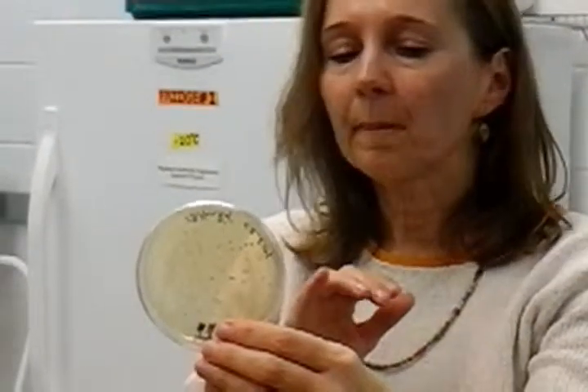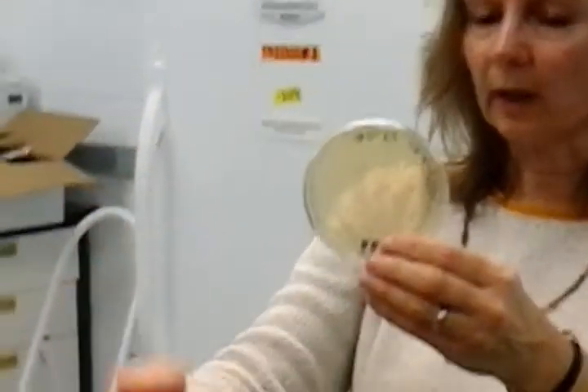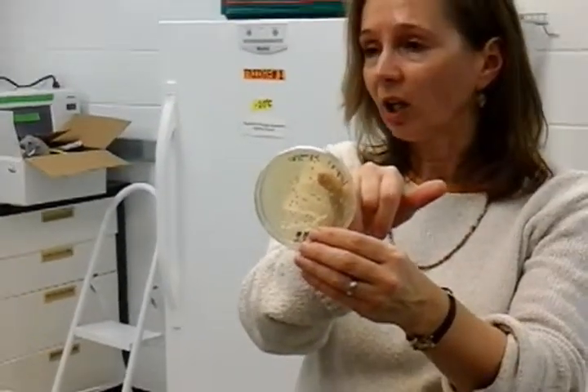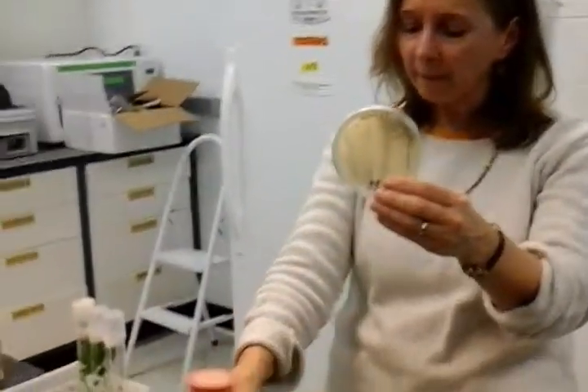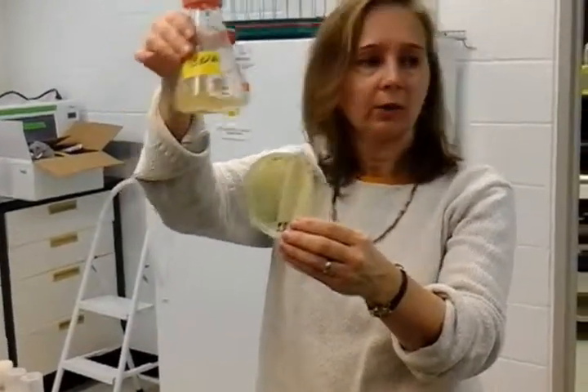If we didn't, we'd have a lawn of agrobacterium growing. When we do the overnight cultures, we actually do PCR on the colony — we'll just take the colony, put it into a solution, do PCR, and make sure it has the vector in it. Then that goes into the liquid medium and into a shaker overnight.